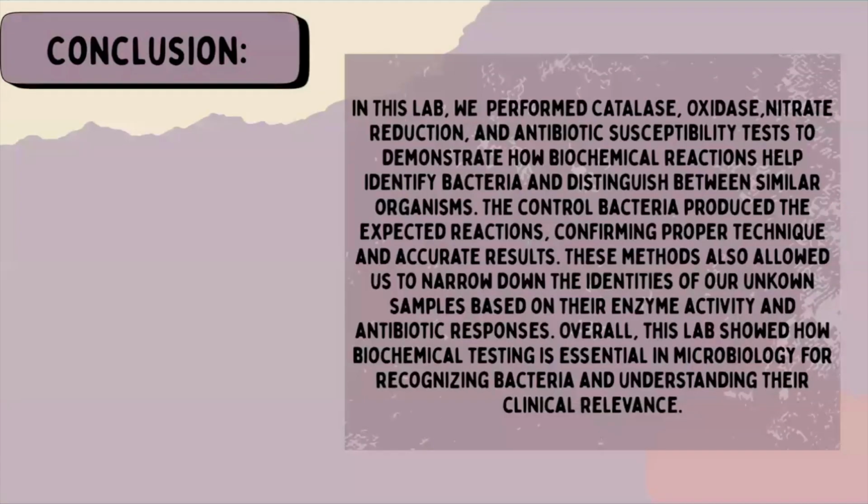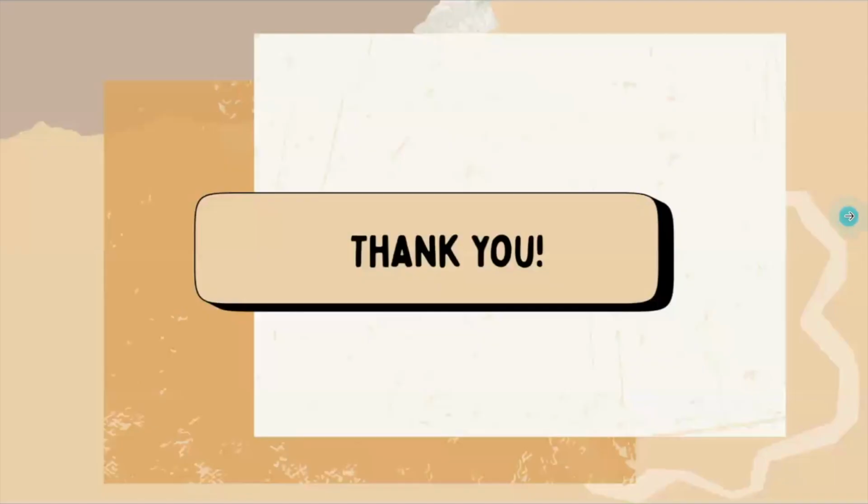Conclusion. In this lab, we performed catalase, oxidase, nitrate reduction, and antibiotic susceptibility tests to demonstrate how biochemical reactions help identify bacteria and distinguish between similar organisms. The control bacteria produced the expected reactions, confirming proper technique and accurate results. These methods also allowed us to narrow down the identities of our unknown samples based on their enzyme activity and antibiotic responses. Overall, this lab showed how biochemical testing is essential in microbiology for recognizing bacteria and understanding their clinical relevance. Thank you for listening to our lab video.